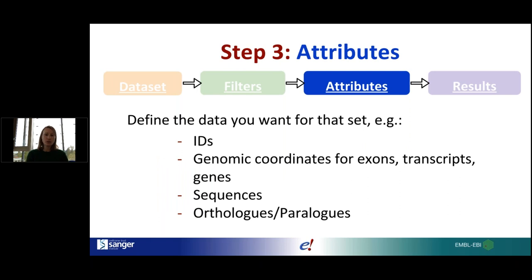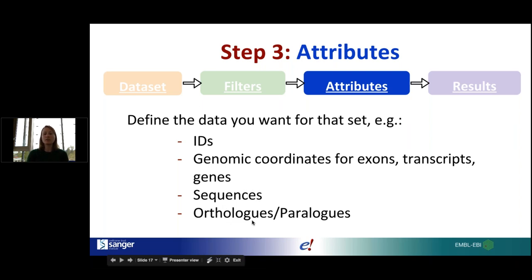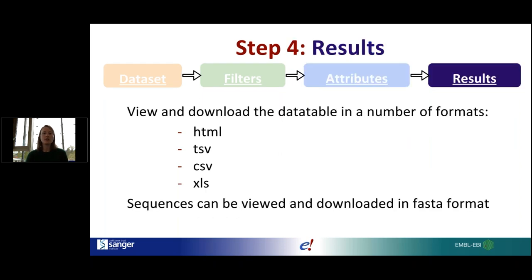Attributes are the answers you want regarding your filtered dataset. Continuing the previous example — if we're looking for entities associated with a genomic region and a phenotype — we could retrieve gene or transcript IDs, the genomic coordinates of those entities, download their sequences, or find homologues in other species or the same species associated with those filters. Results can be generated in tabular format and viewed in the browser or downloaded as a spreadsheet, or retrieved as FASTA format for sequence data.